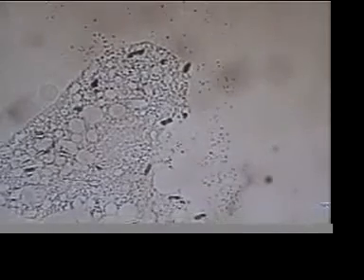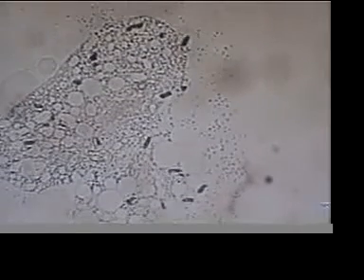Let me move them a little to your left there, so you can see it a little better. You see all those spheroids that formed? That's very interesting and unique to this process. We can probably highlight those outlines by changing the focus a little bit. Lots of spheres everywhere.